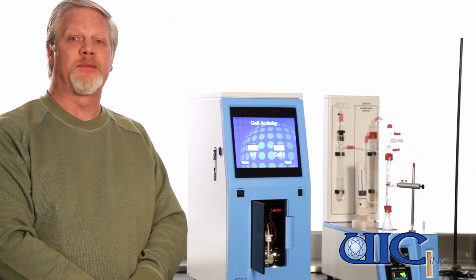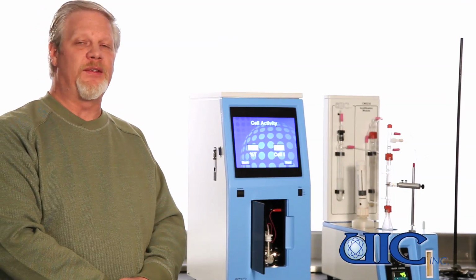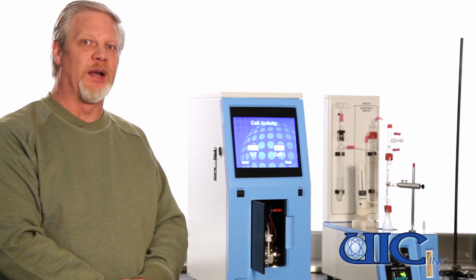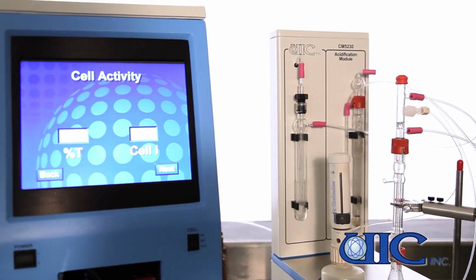And it should take about 5 minutes to titrate down to the endpoint. At that point, we'd let the cell equilibrate for about 30 minutes before we come back and continue our analyses. While we're waiting for the cell to equilibrate, why don't we go over what's happening with the acidification module.